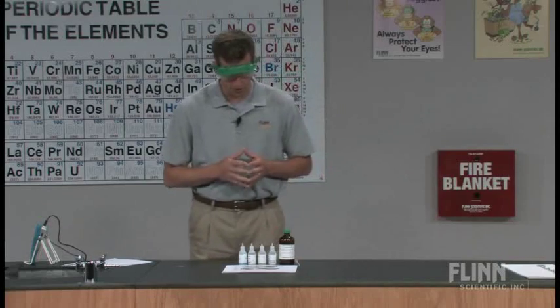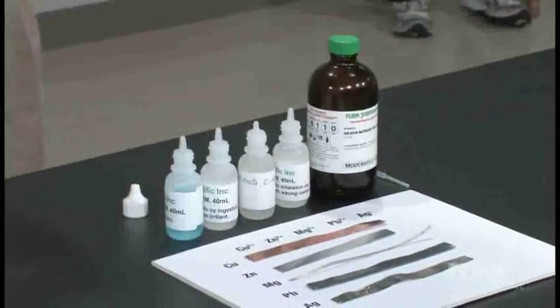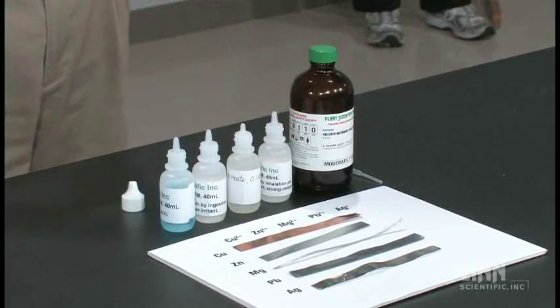What I have set up on the whiteboard in front of me are five strips of metal: copper, zinc, magnesium, lead, and silver. Across the top, we're going to use the nitrates of the particular salts of those metals.